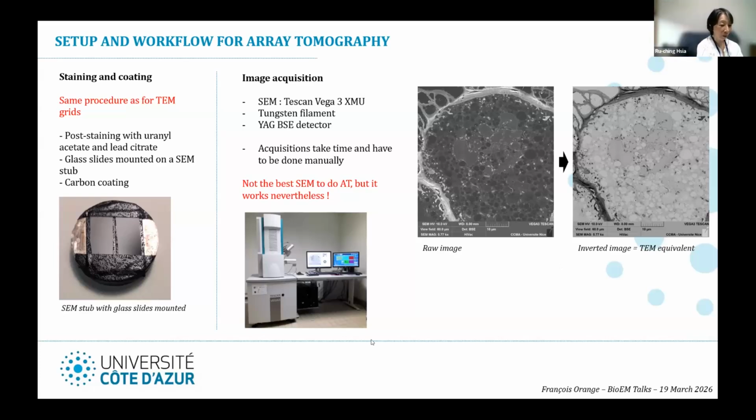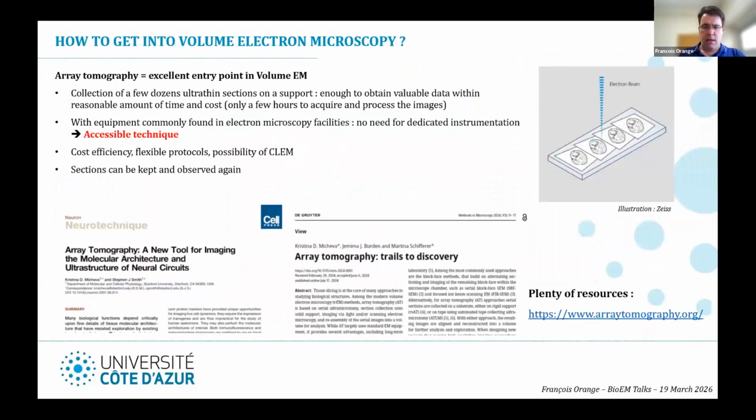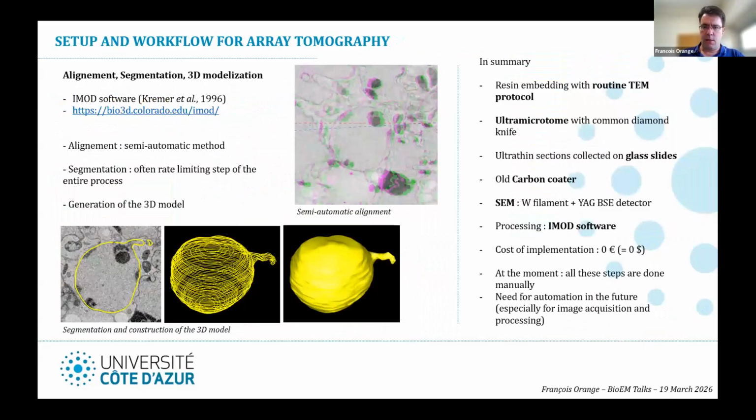Okay, so two more questions. Melissa asked again, have you tried doing stack alignments in Fiji using SIFT or something similar instead of iMod? I haven't. I will go back to the alignment slide. I haven't because I went into the Midas module from iMod, which I use for the alignment, and I find it very powerful, especially for array tomography.